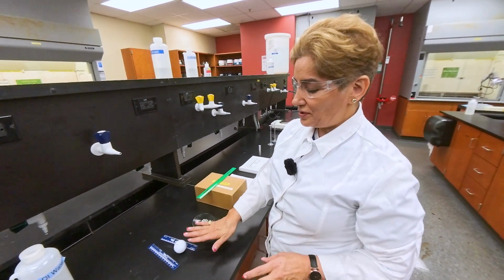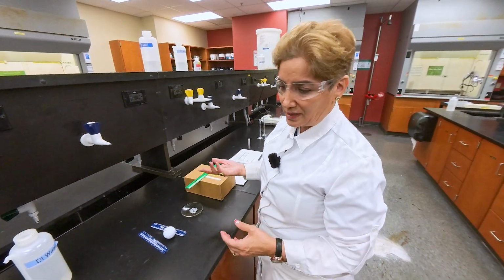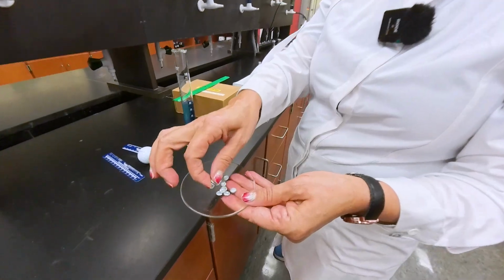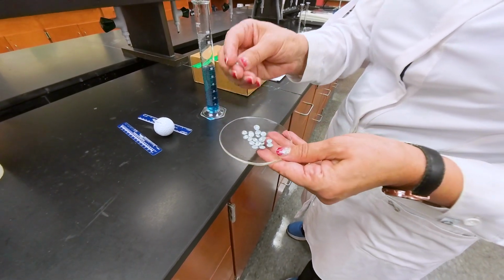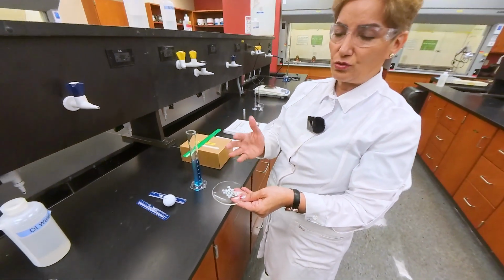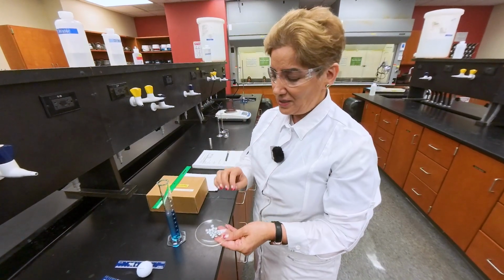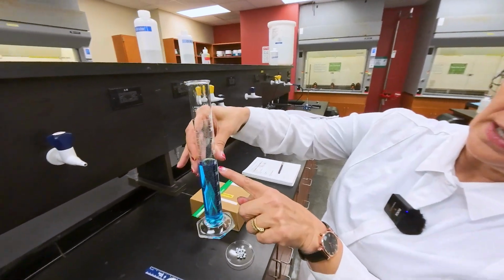Now, if the object has a perfect shape, we can use the dimensions to calculate using math equations. If the object doesn't have a perfect shape, like these zinc pellets or pieces of zinc, I have 20 of them. And why don't I use only one? Because it's too small and the increase in the volume is not going to be significant, so I'm using 20 pieces for that reason. I can use this technique, which is called measuring volume by difference.